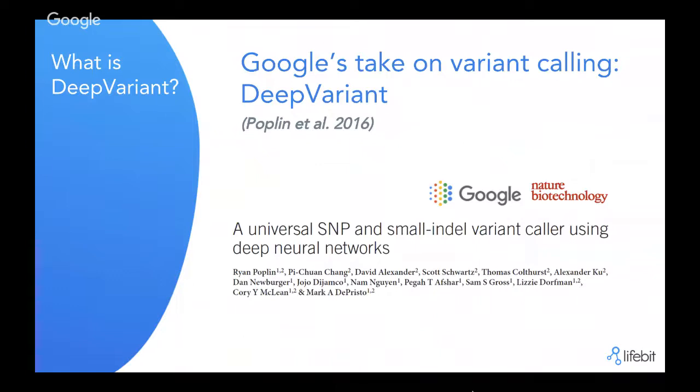It can even be used with other sequencing technologies, and also even in some other species, for example. In some of the analyses, DeepVariant managed to show that the accuracy of applying a model trained on human data, when you try to call variants in the mouse genome, is even higher than trying to train DeepVariant models from scratch on mouse data, which is quite impressive. Although it also kind of makes sense because of the large amount and quality of the data that we have publicly available for human, right?